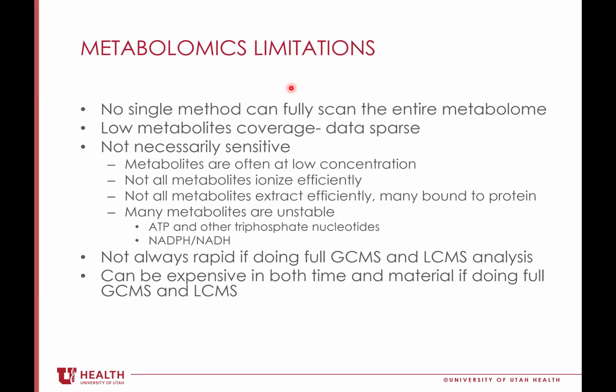It's not necessarily sensitive. Metabolites are often at low concentration, and those low concentration metabolites contribute to a lot of that data sparsity. Some of the instruments that we have now are really, really good and can do a lot of those low concentration metabolites, but that's always an issue. Mass spec doesn't work on every metabolite. Not all metabolites extract efficiently.